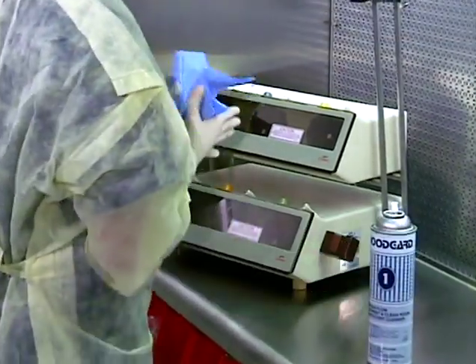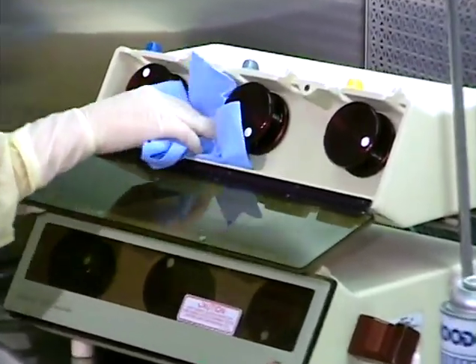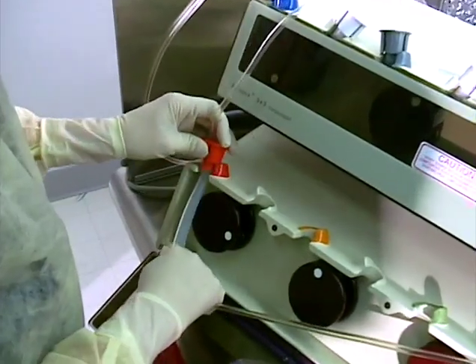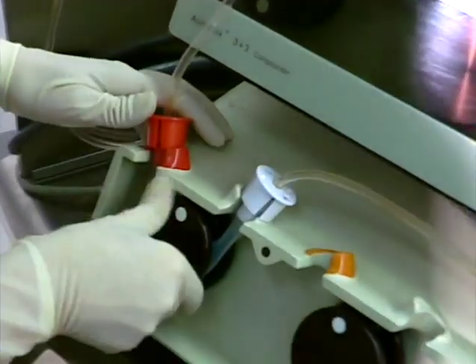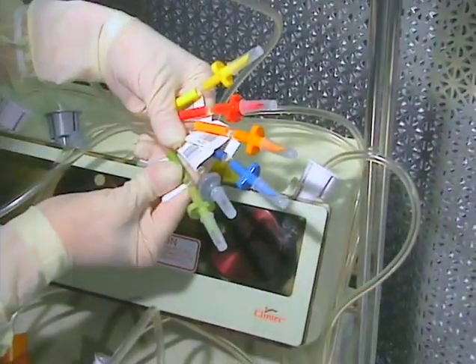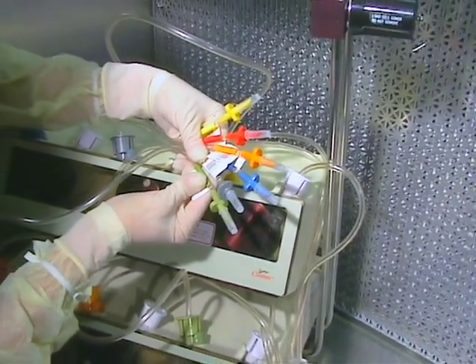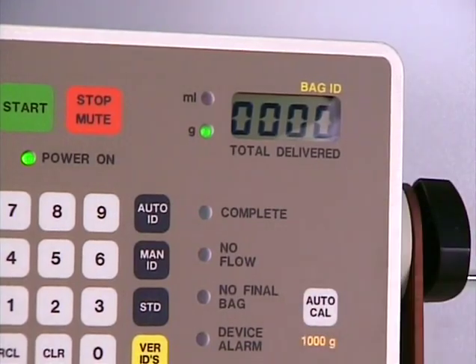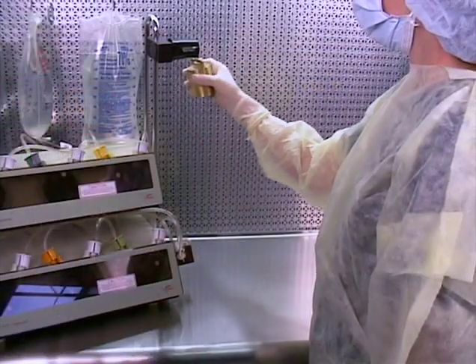Clean the compounder and install the tubing in accordance with the manufacturer's instructions. Be certain that each tubing connector is installed in the correct pump location and the tubing is properly seated. Make sure that all spike covers remain firmly in place during these procedures to assure sterility. When the compounder is clean and set up, calibrate in accordance with the manufacturer's instructions. This is essential for accuracy.